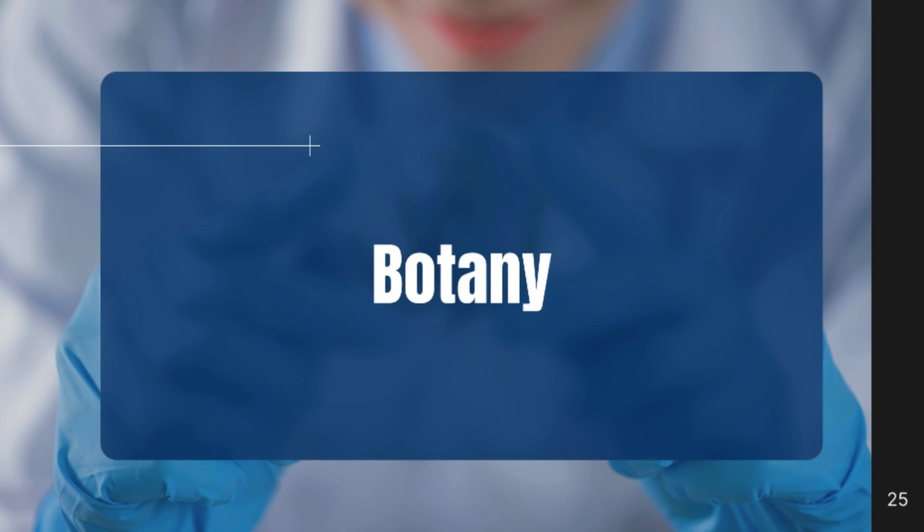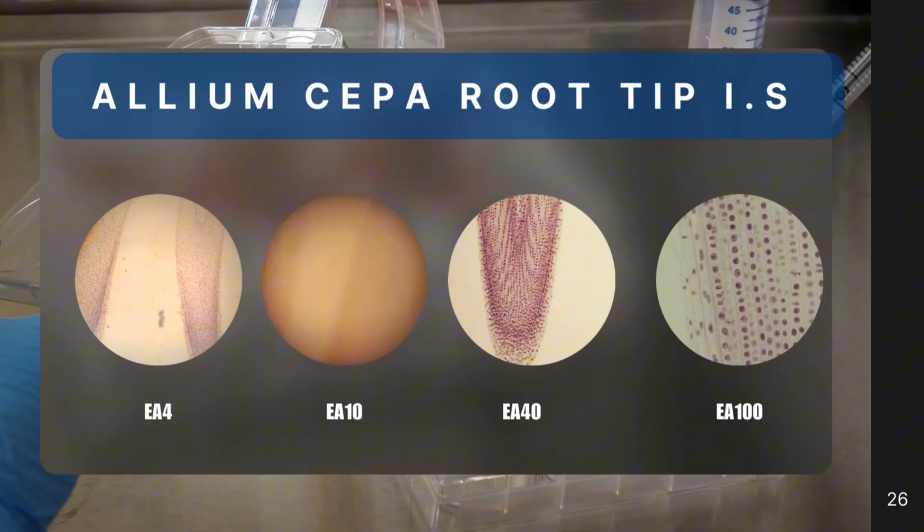Next, we have botany. Botany is the scientific study of plants, including their physiology, structures, genetics, ecology, distribution, classifications, and economic importance. So first, in the botany, we have the Allium cepa root tip longitudinal section.